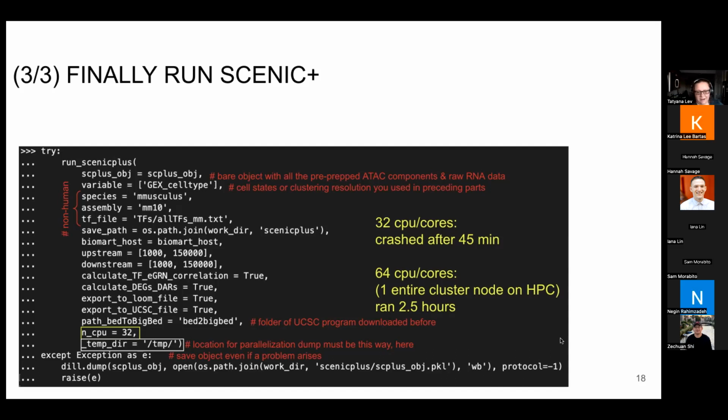All right. How many features should pass? Oh, Z asked, how many features do you have for ATAC-seq? Passing QC was like 7,000 something. Okay, 7,000 something. I think so. Yeah. All right. But yeah, sorry for interrupting. Thanks. Okay. Continue.